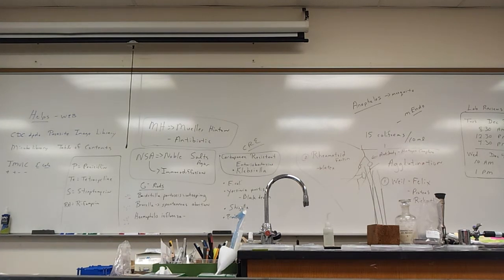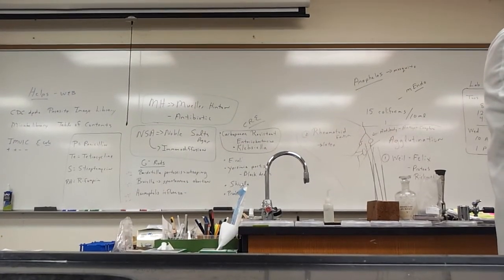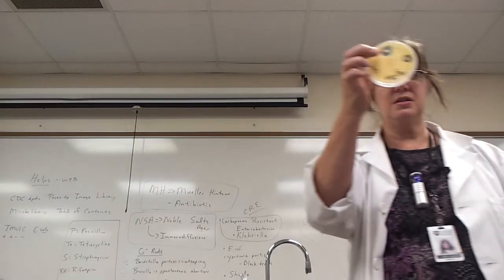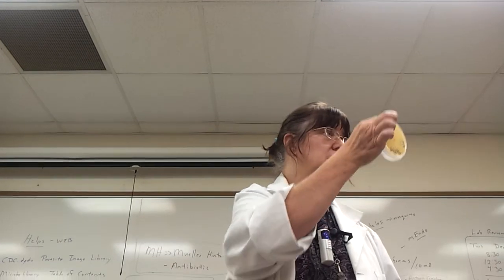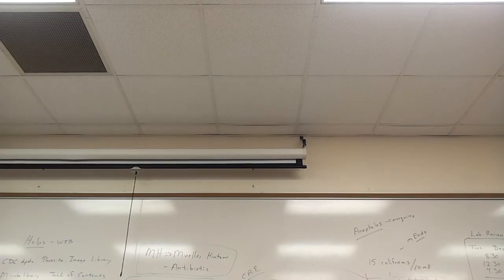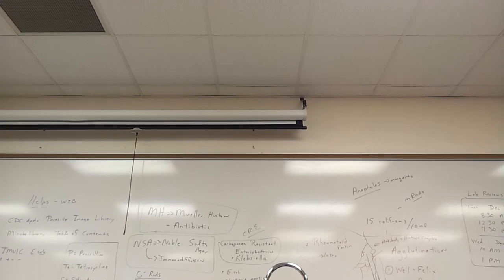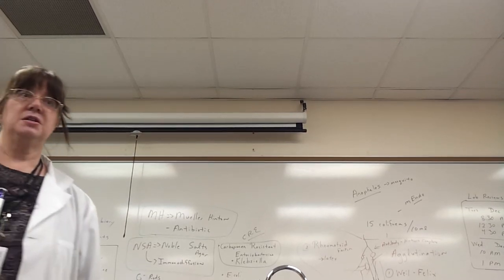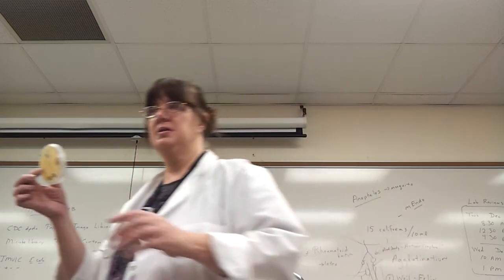If this was the one, would that organism be very sensitive or very resistant to that chemical? Say sensitive, because it killed it. That's why there was a zone with no growth. Now, if I was doing this one, would that organism be more resistant or more sensitive to that chemical? More resistant. Be careful not to mix it up. And actually, people can change it to the chemical's point of view, but I'm not going to do that to you.